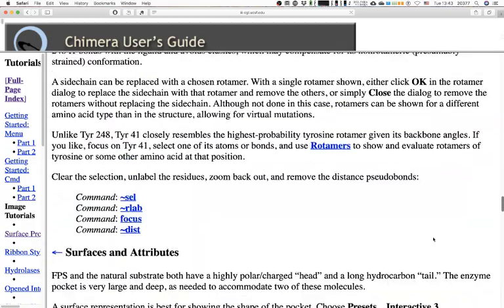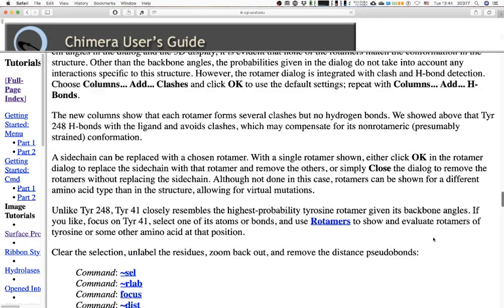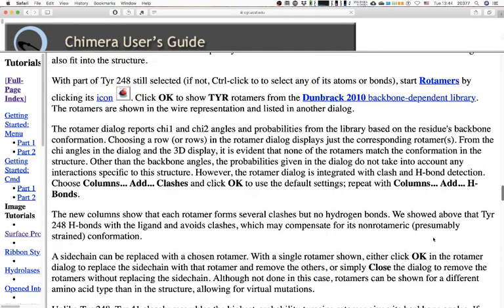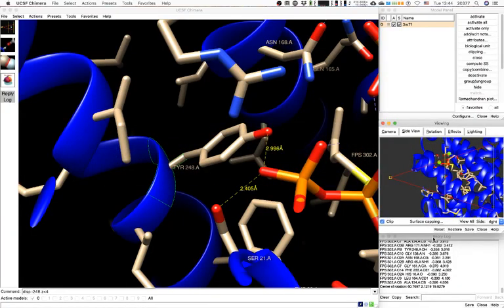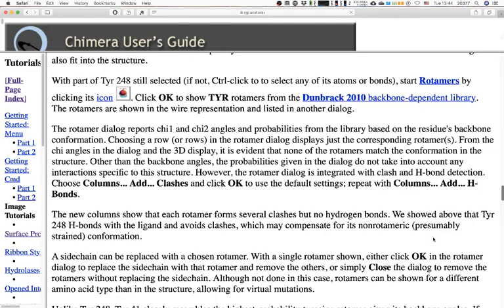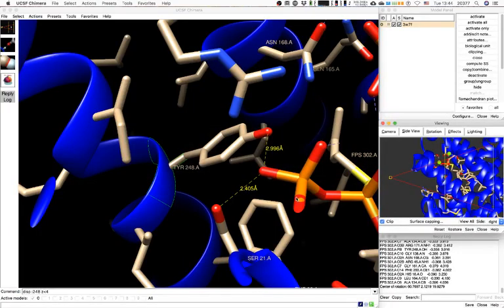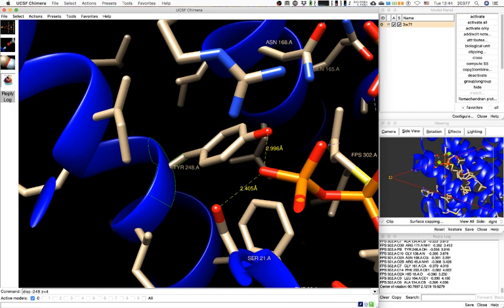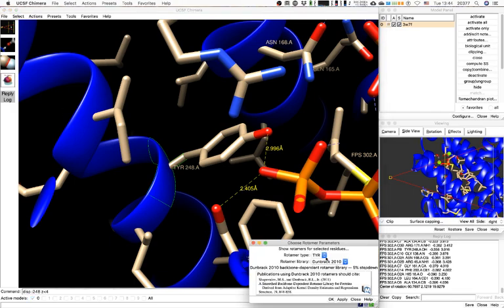We are going to finish this section and leave surfaces and attributes for next time. With part of tyrosine 248 selected, start Rotamers by clicking the rotamer hat icon. We have tyrosine — click OK to show tyrosine rotamers for the Dunbrack 2010 backbone-dependent library. These will be shown in a wire representation in the dialogue.